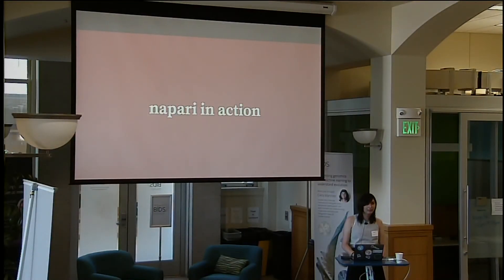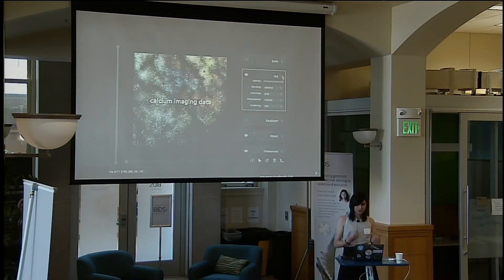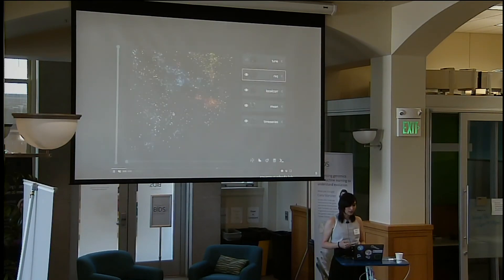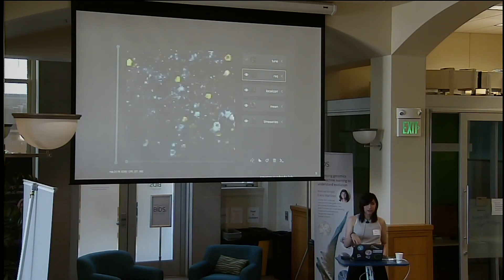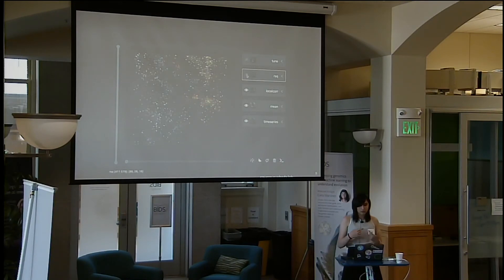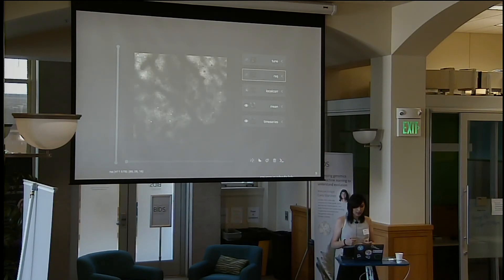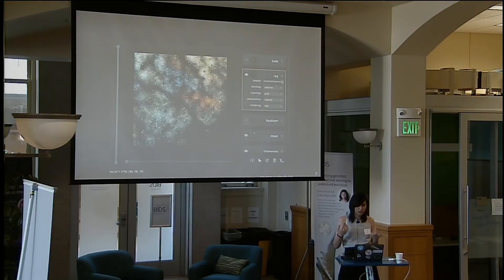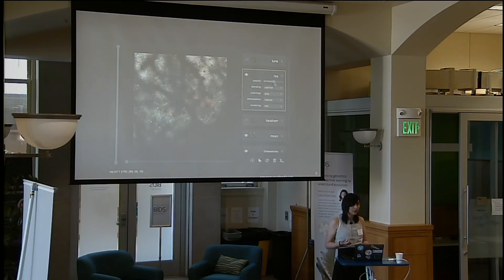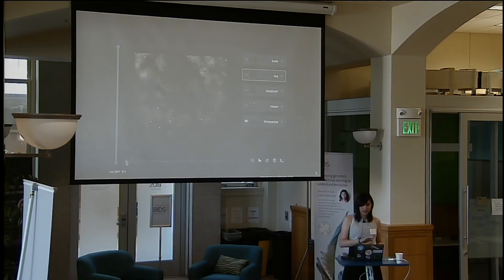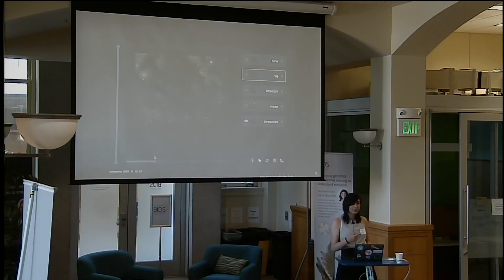I'm going to show some examples of NAPARI in action. This is some calcium imaging data from the Svoboda lab. You can see us panning and zooming around, and we can show and hide different layers. You can click on the arrow to expand the properties and change things like opacity, blending mode, color map, etc. We're going to hide all of these layers and go to a multidimensional layer which is the time series.